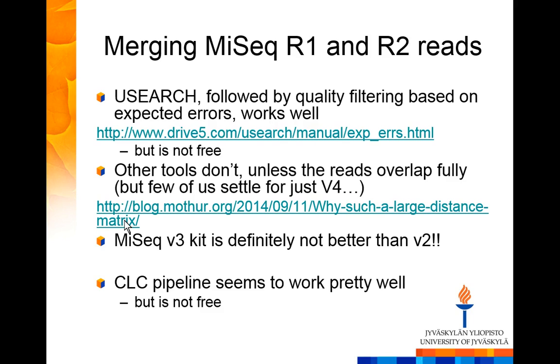But also from experience, if you try to amplify too long a region, but I'm not actually sure. For example, for Ion Torrent PGM, the problem is not the sequencing. You will never get most of your sequences 400 base pairs long, even though that's what they say. But the emulsion PCR, the first step in the preparation of the sequencing template, will work for that long and a little bit longer. I'm not actually sure about MiSeq.